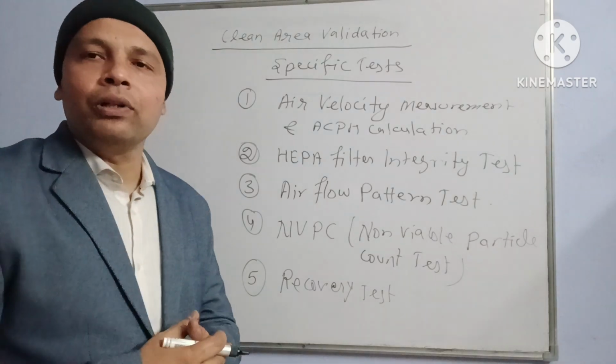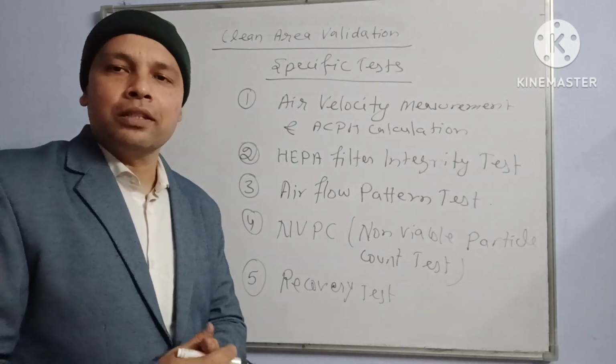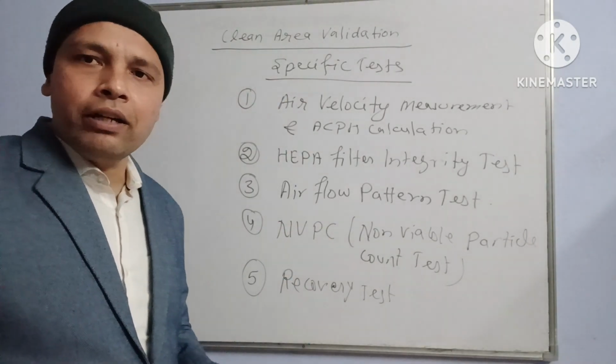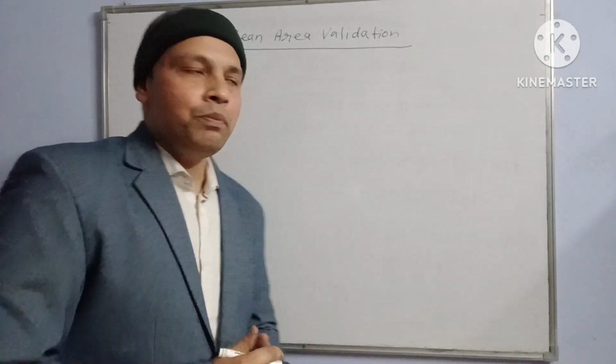If we consider WHO TRS 1044 or the current GMP guidelines, we have to follow these tests. These are the specific tests. There are also some basic tests that we should do during the clean room validation. Then we perform some general tests.